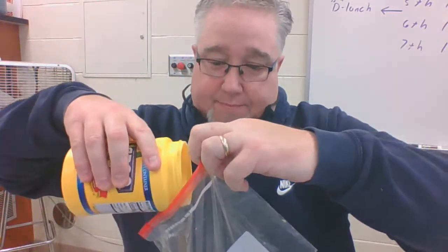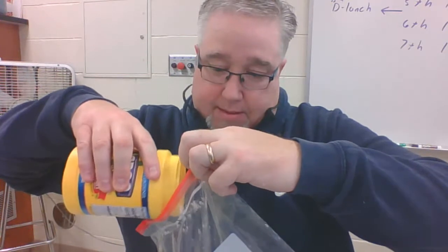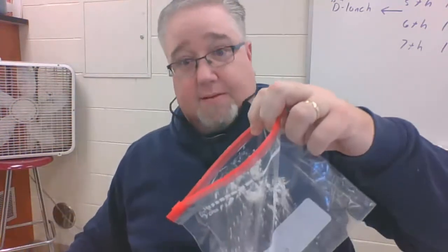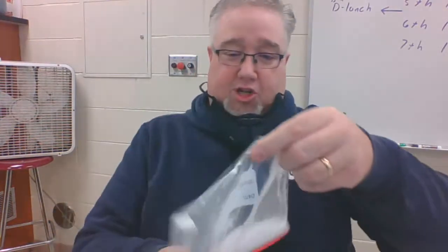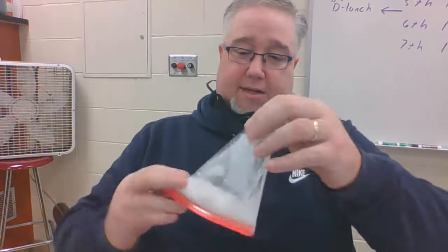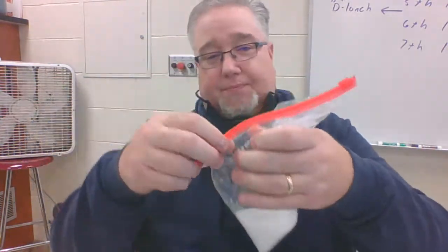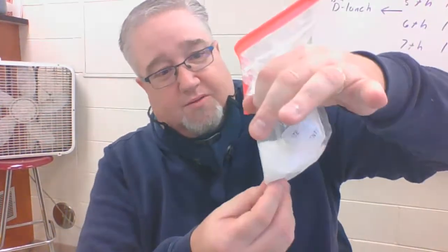It kind of looks like baking powder a little bit. I'll pour a little bit of that in there. That should be enough. I'm going to seal my bag and give it a little shake. I'll try to mix things up the best I can in here. So now you've just got a little mixture of water and cornstarch. That's all it really is.